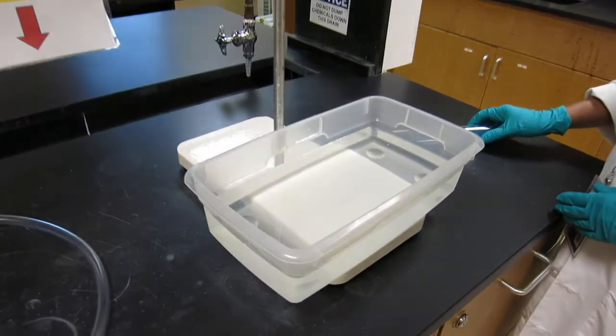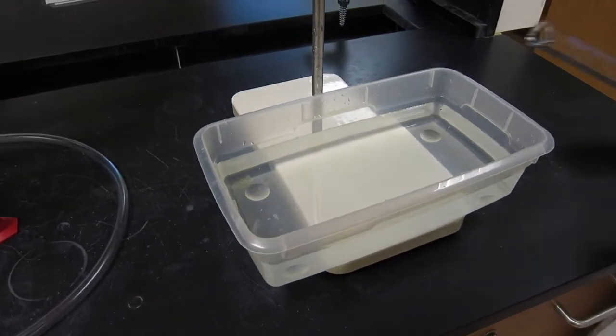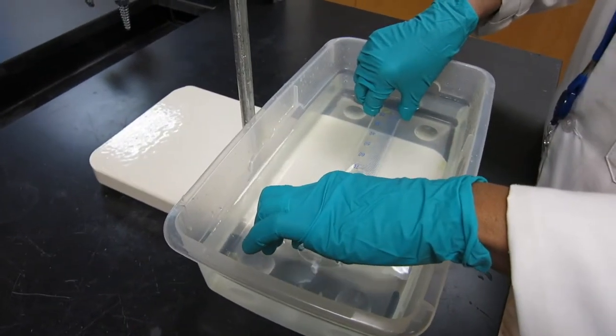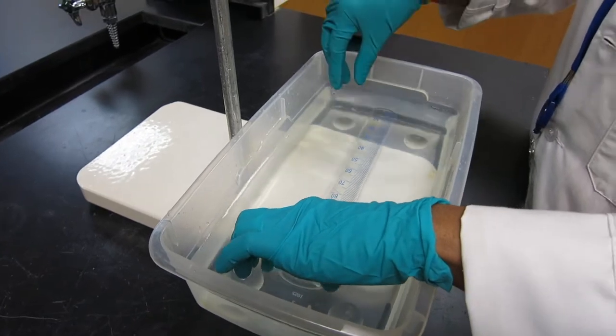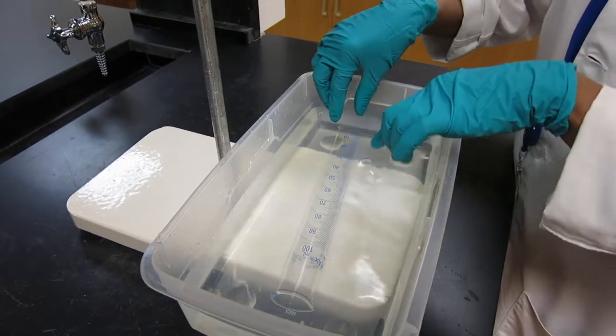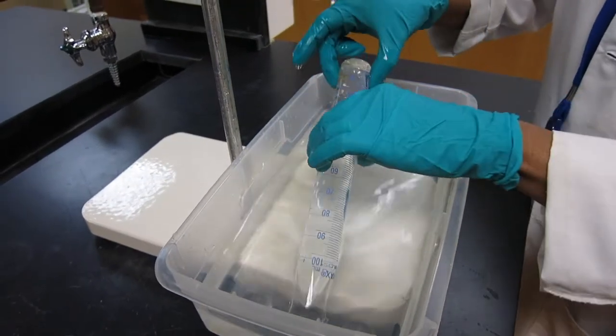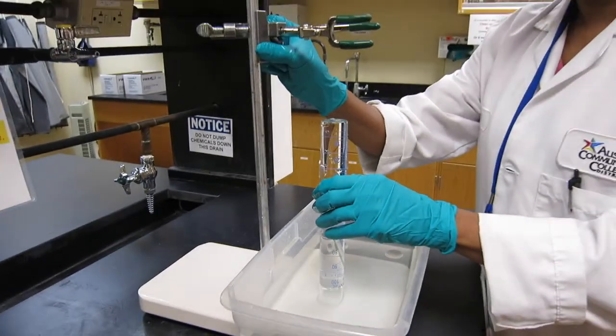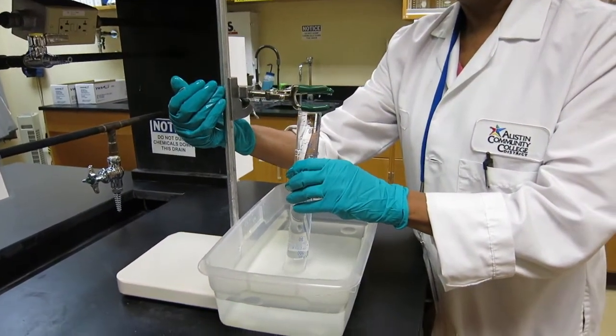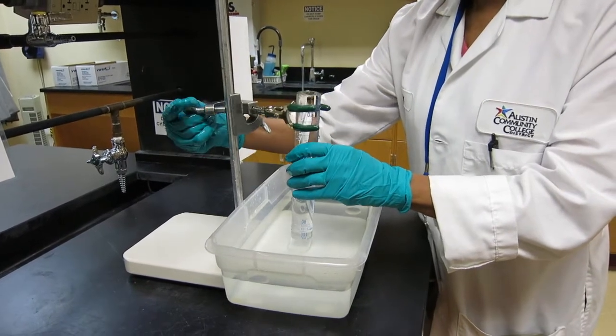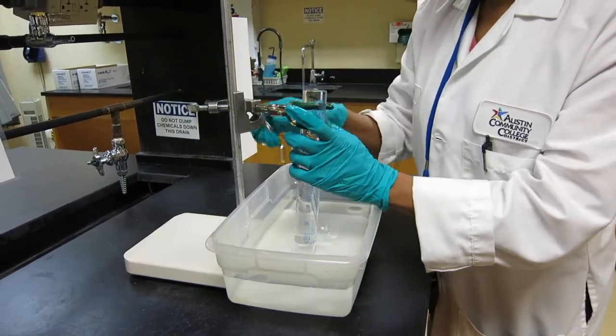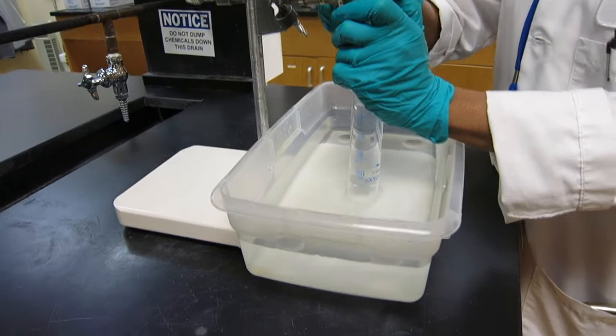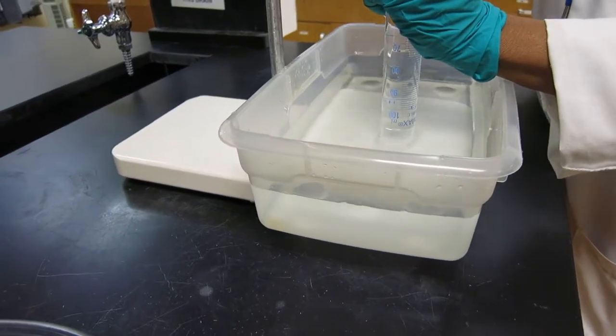So we fill out the container with deionized water. Right now we are going to submerge the graduated cylinder and fill it up with water to make sure there is no bubble. And we are going to make it stand like that. We are going to clamp the cylinder like so. Make sure you have enough room on the bottom.